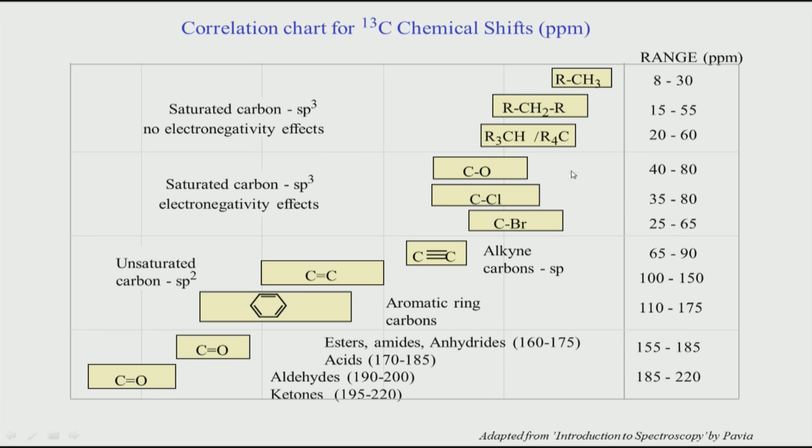Next, if you go to the next zone, you can see we can divide this whole NMR carbon range into 4 different zones, which is shown broadly here.